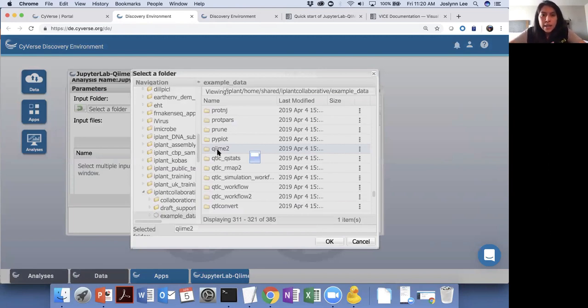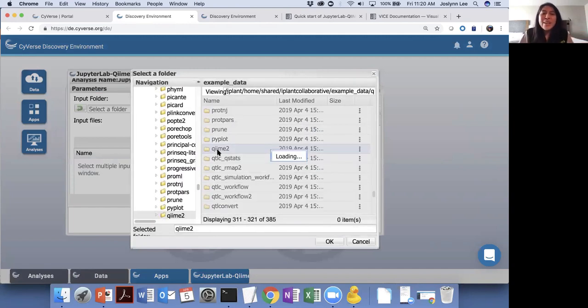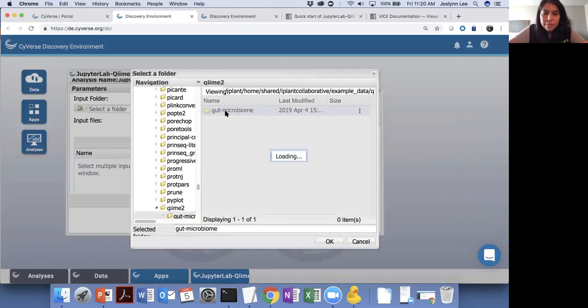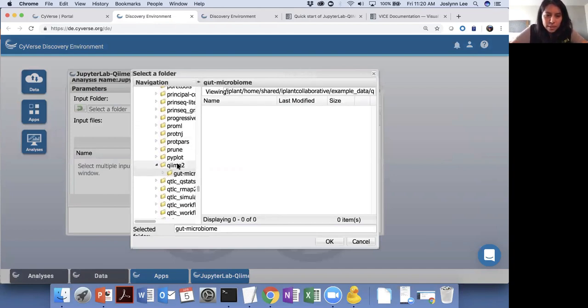data. I had to go through to figure out how to reassign sample IDs. So I did the heavy work for you because it really was all the raw data for this. Okay, so in here, this is a little problematic, but we'll fix it. There were supposed to be a few other files in here, but maybe they'll show up. Let's just do QIIME 2 for now. I have a backup already set up, so we'll make sure that if you want to access this data, it works.